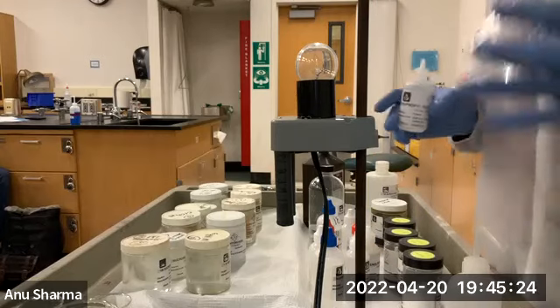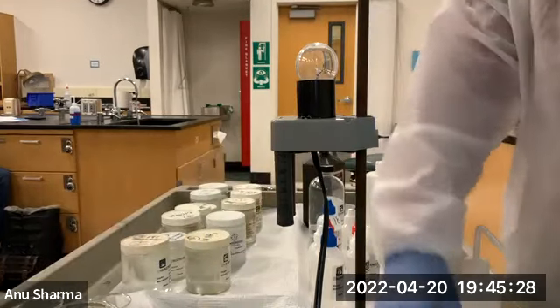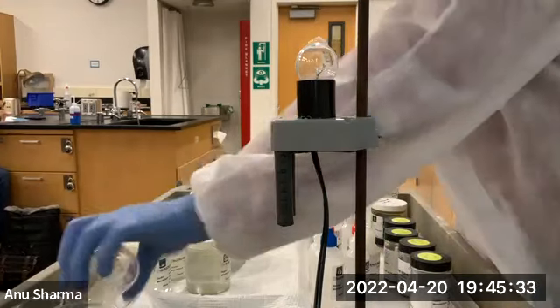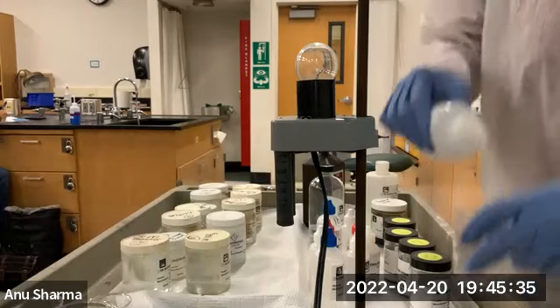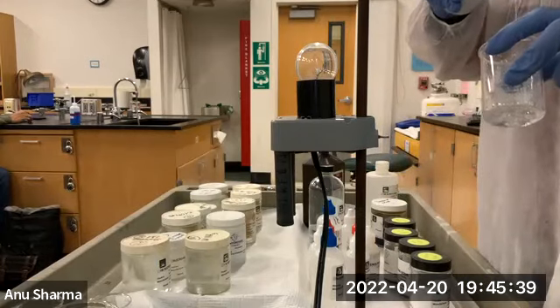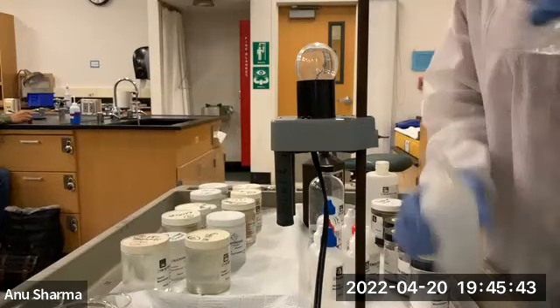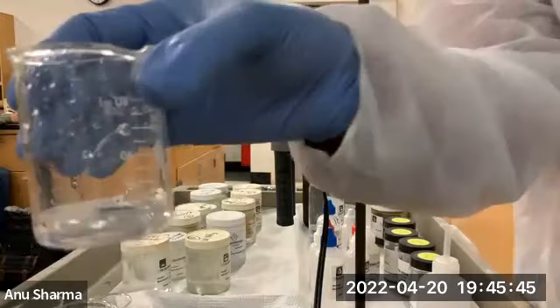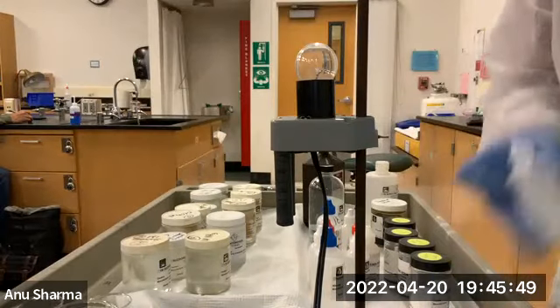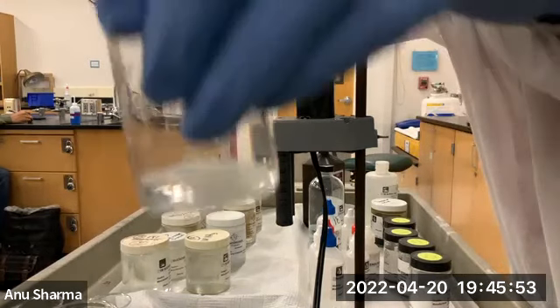Now isopropyl alcohol will also dissolve in water because of the OH, right? Hydrogen bonding. All right, so here is the water. I have this pure and clean water, okay? And now I'm pouring some isopropyl alcohol in it.